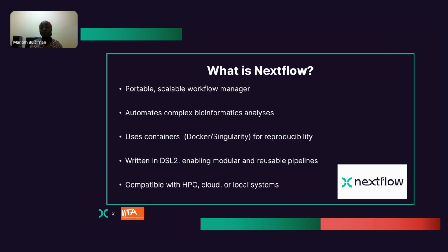So let's start from the foundation. What exactly is Nextflow? Nextflow is a workflow manager that helps to handle all the behind-the-scenes chaos of running bioinformatics pipelines. It is portable and scalable, and it helps to automate complex bioinformatics analysis. Basically, you tell Nextflow what to do, and it figures out how to do it efficiently and consistently.